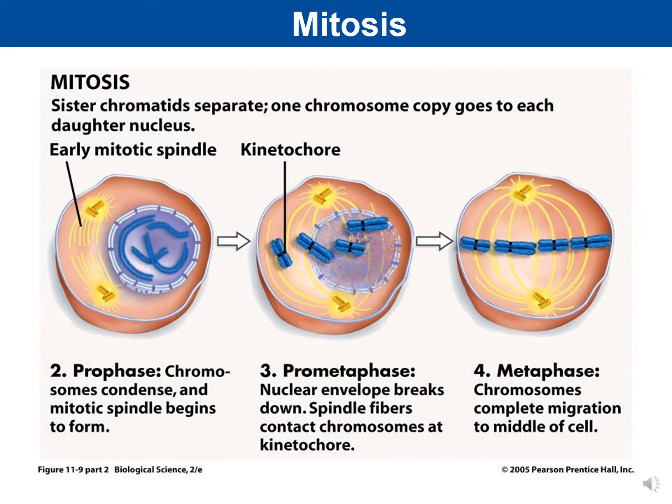So now, when we are looking at our phases of mitosis, again, it depends on who you ask. Some people will divide mitosis into 4 phases, and those 4 phases would be PMAT. It's the easiest way I can remember that. Prophase, metaphase, anaphase, and telophase.